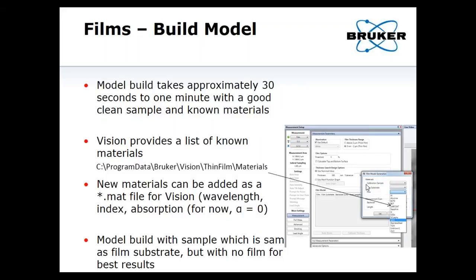We have pre-baked materials already provided with Vision with this add-on. The most common coatings — silicon dioxide, silica, alumina, that kind of thing — will already be defined. You need the optical properties to do this measurement. If you want to add your own material, such as something exotic or a less common photoresist, you can pull those values from a resource like refractiveindex.info and directly add them. This is a database kept in your Vision program data directory, and you can define as many new materials as you'd like.